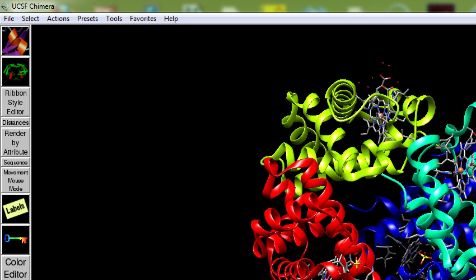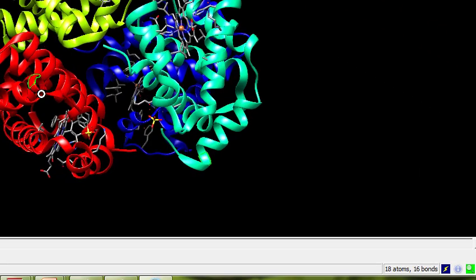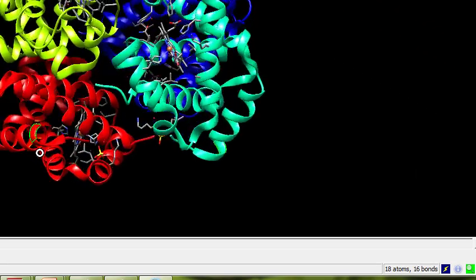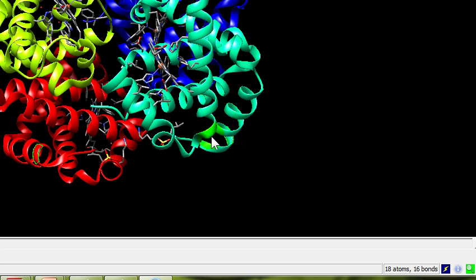We're going to look at the position of where that mutation occurs by lighting up that glutamic acid number six. We'll do that by hitting enter. When you hit enter, you can see it lit up right there with a little yellow around it. It's also lit up one over here. You may not be able to see it, but I can on my screen, right in here.